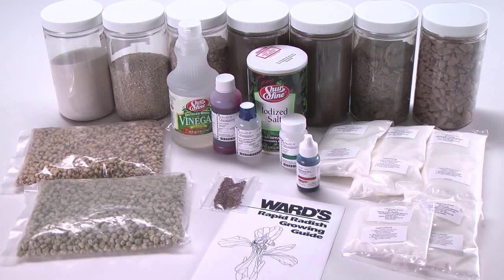Various plant systems are available for study through use of the three varieties of plant seeds included in the toolbox. These can also be used in conjunction with the various soil types and chemicals for changing the environmental conditions for growth.